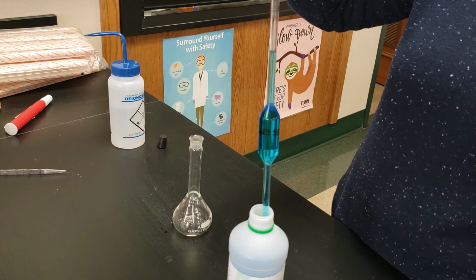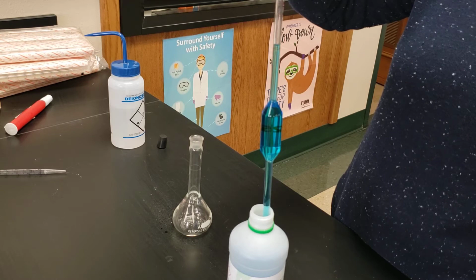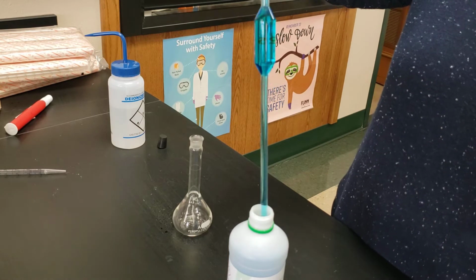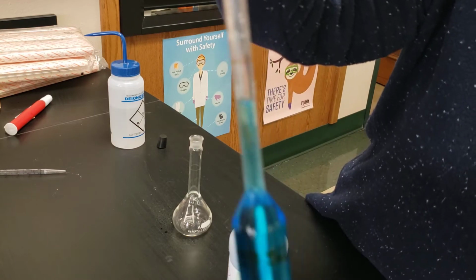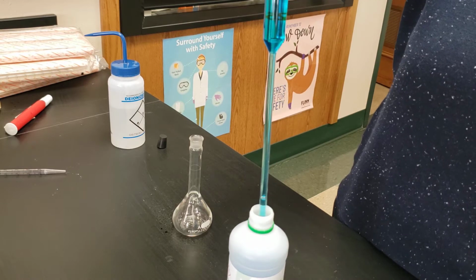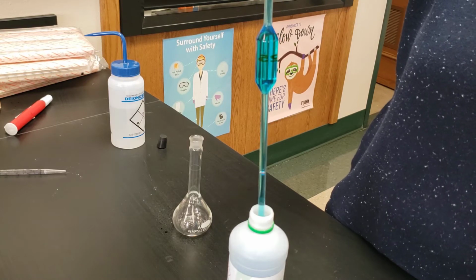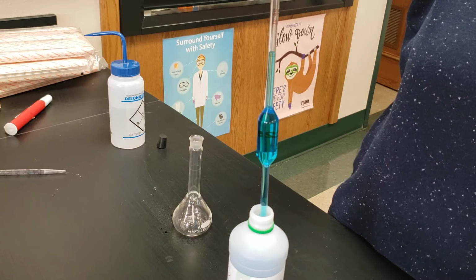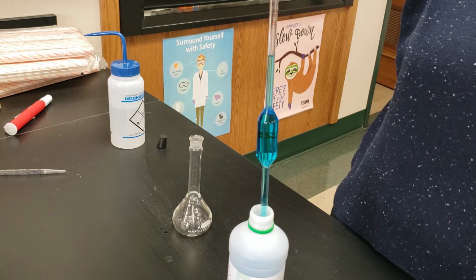So this is going to be my most accurate piece of glassware that I've got, besides my volumetric flask. There we go. It's lined up with a little brown line on the pipette. I'll show you here, as I lose a little bit. I got a bubble. The bubble's going to cause me problems and not give me an accurate volume, so I have to wait for that bubble to get out, which is annoying. There we go. Okay.